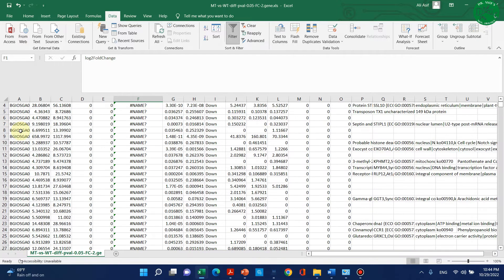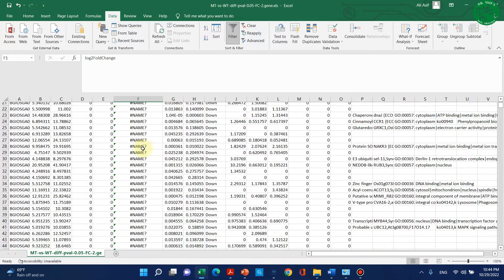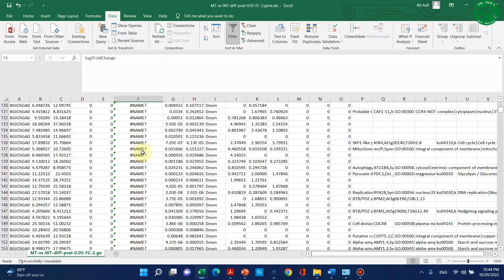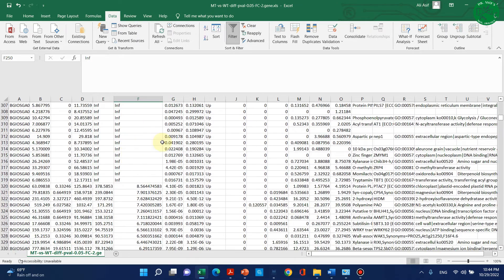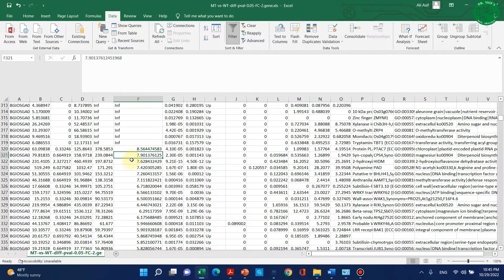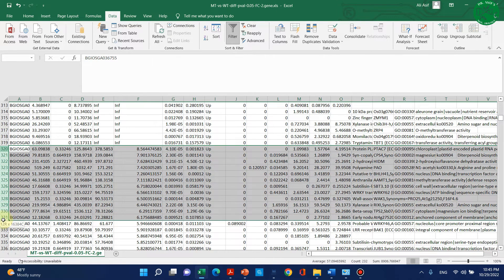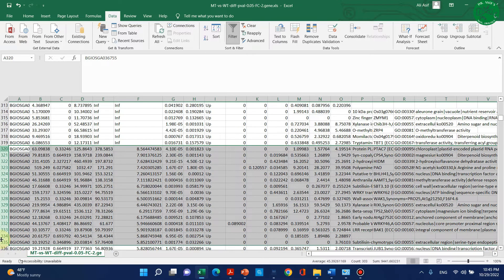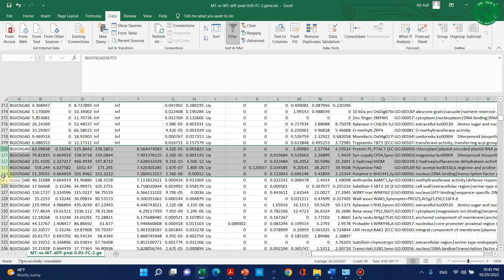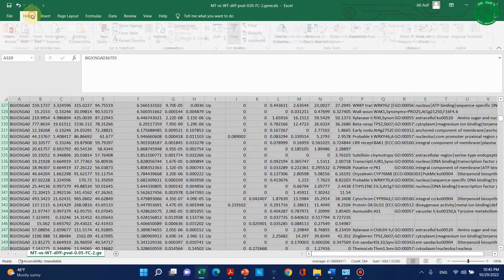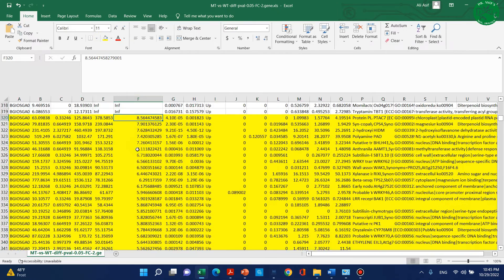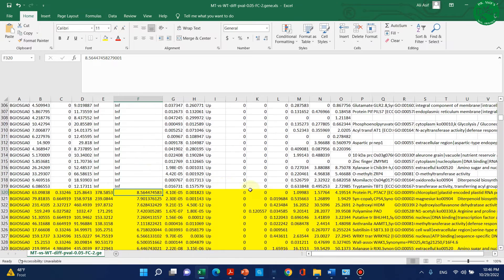You can see all the genes have been sorted. Some genes are not showing DEGs greater than two so we don't need to consider them, and some showing inferior values we also skip. The genes showing a positive FC value are our up-regulated genes. We can select our genes for qPCR through this list — let's suppose we select our top 30, going up to row 350, and highlight them.